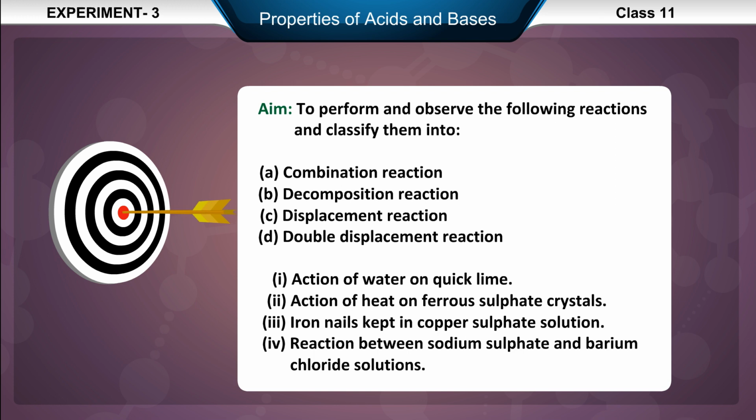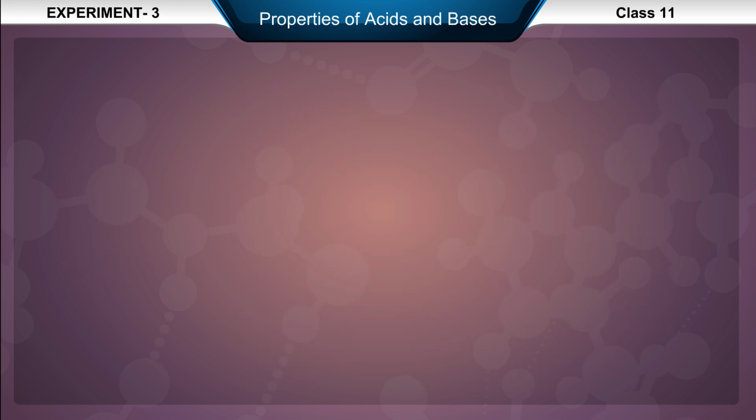1. Action of water on quicklime. 2. Action of heat on ferrous sulfate crystals. 3. Iron nails kept in copper sulfate solution. 4. Reaction between sodium sulfate and barium chloride solutions.